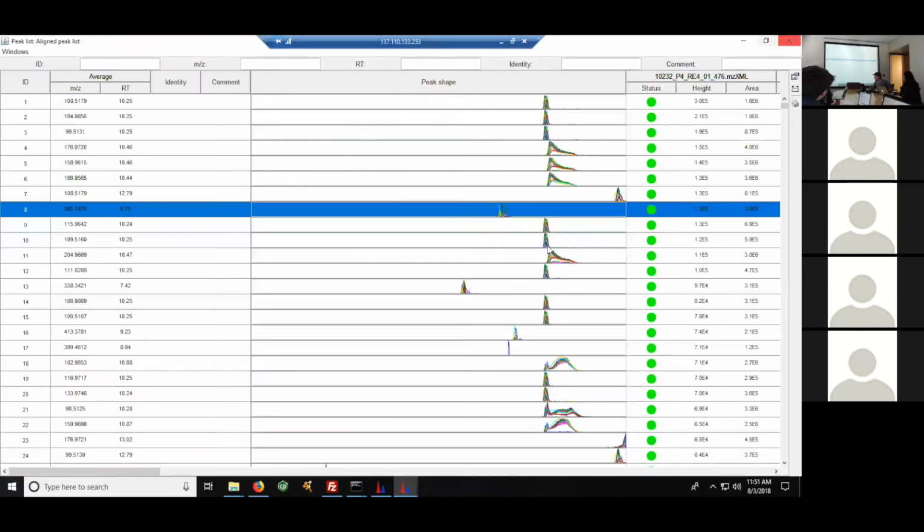Do you think they should be one feature? I mean, it really depends, right? If those two samples were run after each other, then maybe not. But if there were several hundred samples in between, I would not be surprised. A good way to assess this is to run a QC standard in your first sample, and then compare it to one you run after your last sample and see what the variance is.